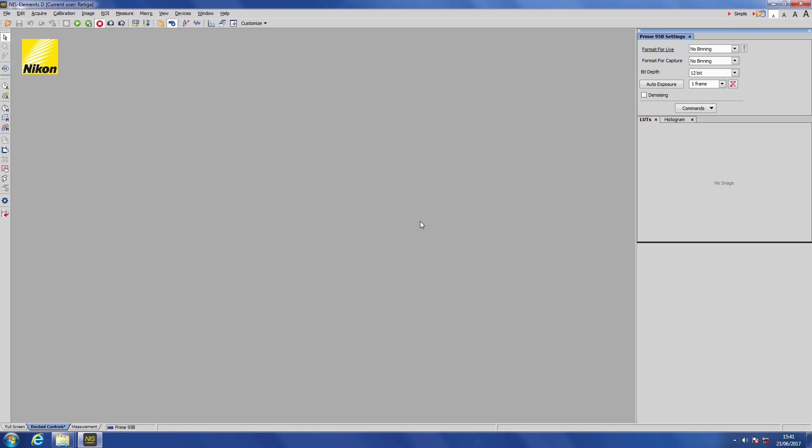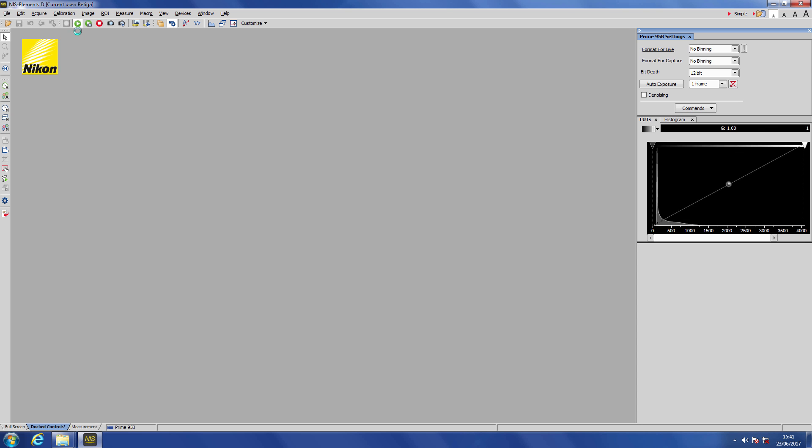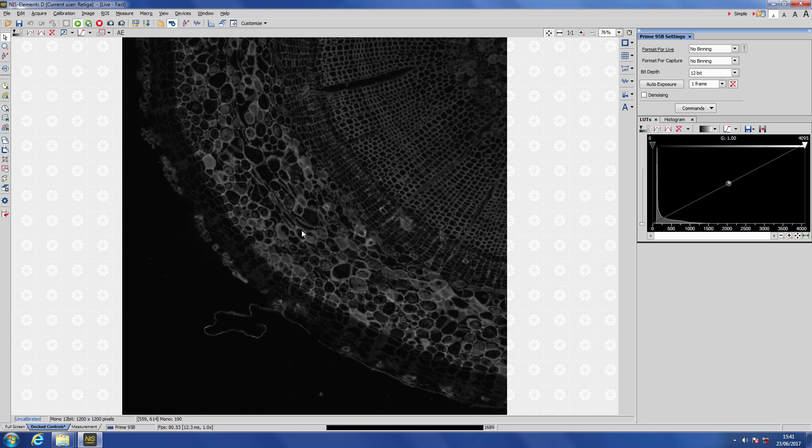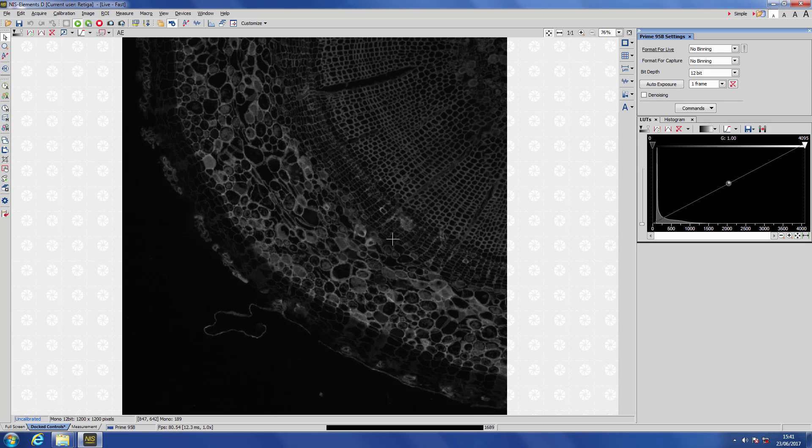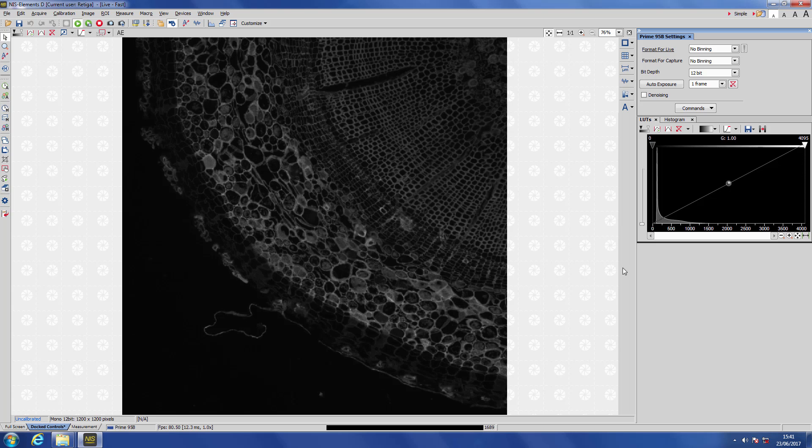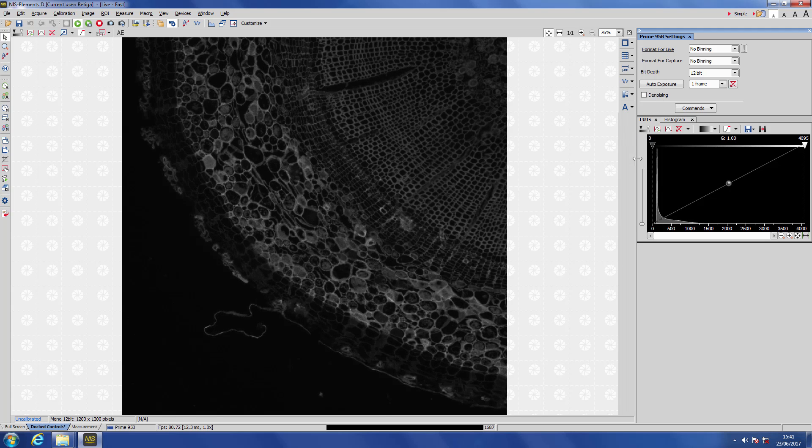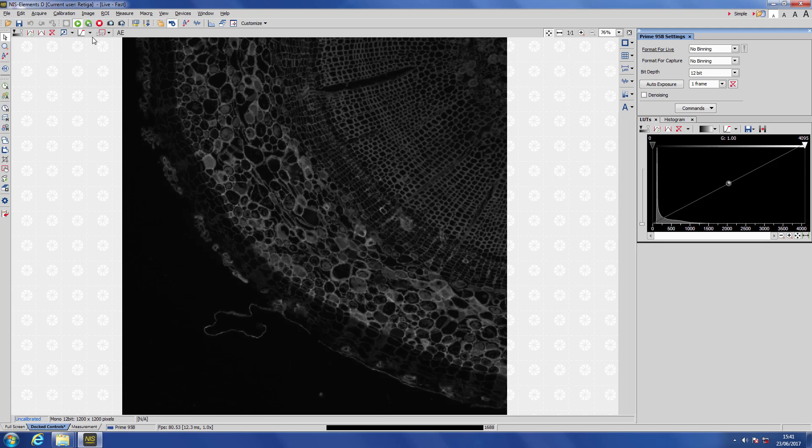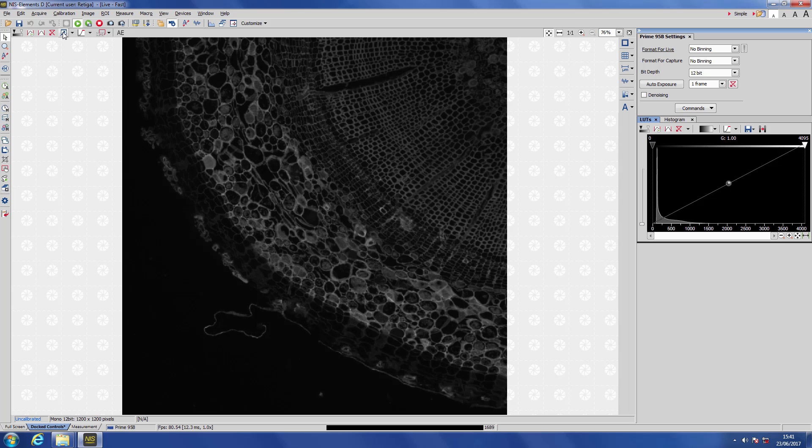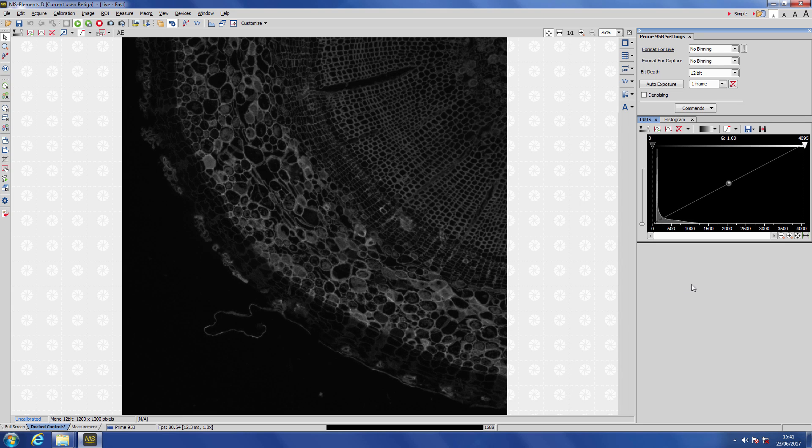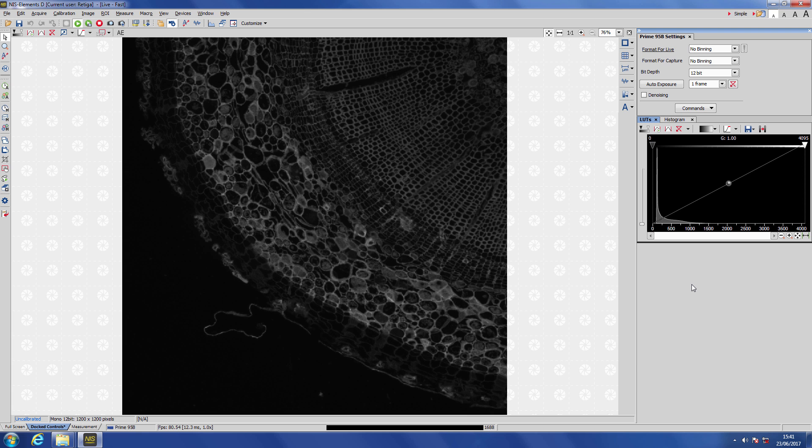So here we are inside Elements. The first thing we want to do is activate our Live Preview mode. But here you see the contrast isn't particularly good because we don't have our Auto Scaling active. To activate Auto Scaling, you can go up to the LUTs toolbar here, the Lookup Tables toolbar, and make sure that you have the Lookup Tables window visible.